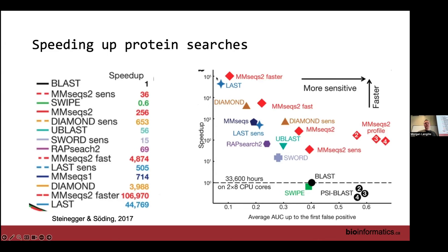The downside of web-based systems, which I meant to mention, so thank you, is that this similarity search is really intensive. If you upload 100 samples of metagenomes, where maybe you've done 10 to 100 million reads each, the web server people are either going to have to make shortcuts, or they're going to have a long queue and you're going to wait a long time for your results, or somewhere in between those two.